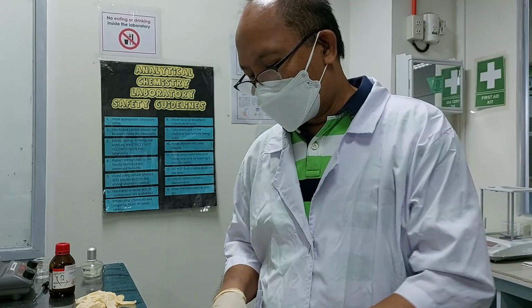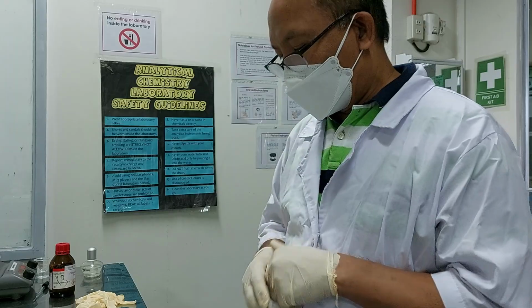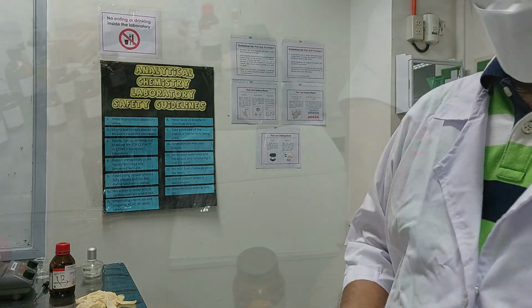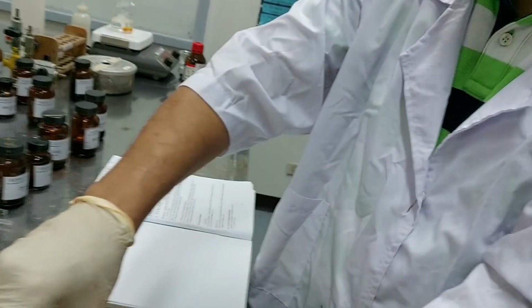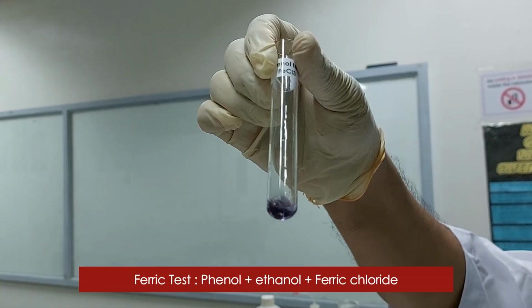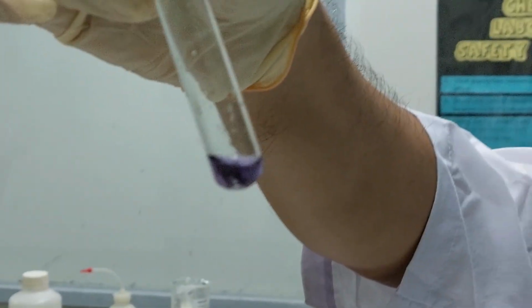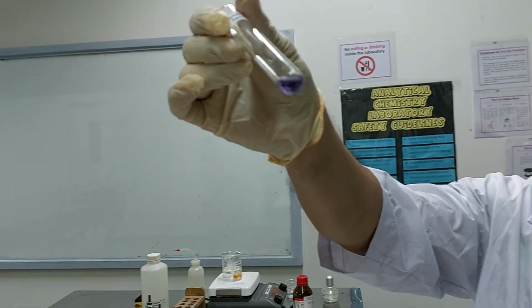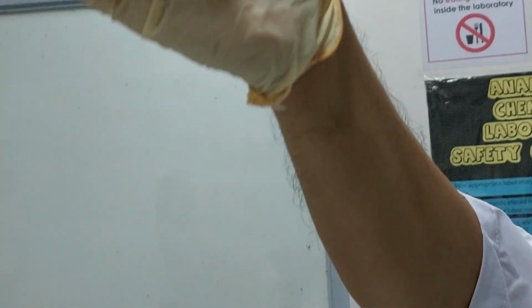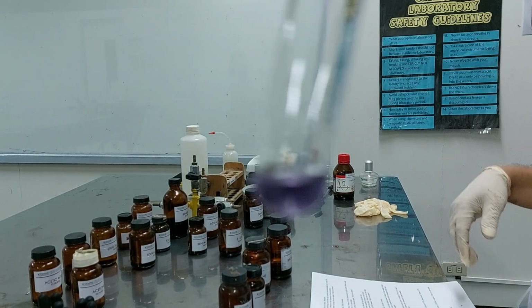Let's see if we can observe that. Let's start with the ferric chloride test and observe the color. There is a change in color right away. Record the change in color. It's a little bit purple. There is actually a combination of colors here, but the one that is very prominent is what? Indigo, right? Indigo.